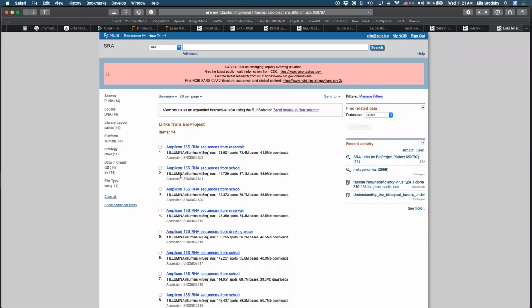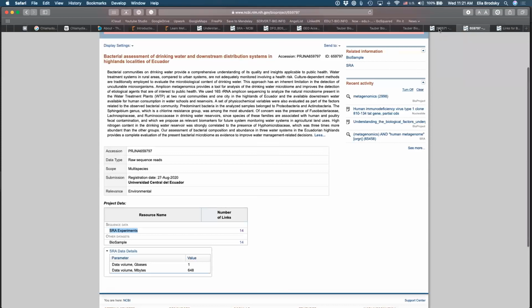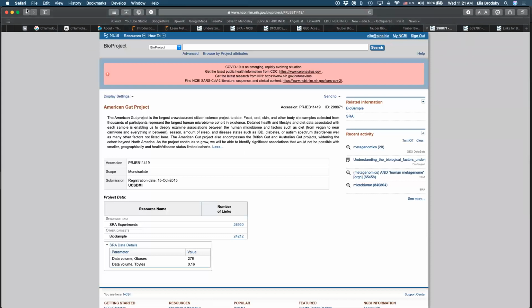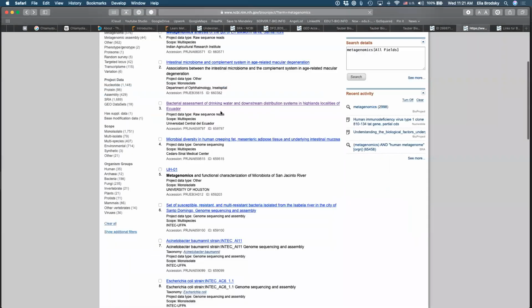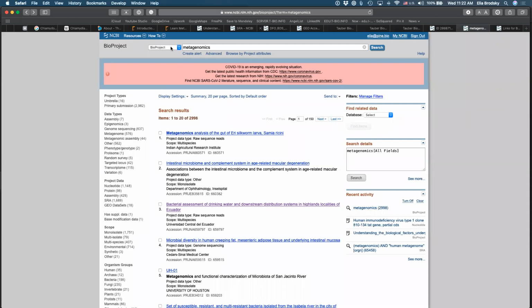Okay. So when you go to NCBI, right? What we did was on NCBI, we looked for just metagenomics or something like that. So we searched for metagenomics. And, okay, did you get to here to just metagenomics on NCBI? Well, no, you don't have to go to Bioproject.